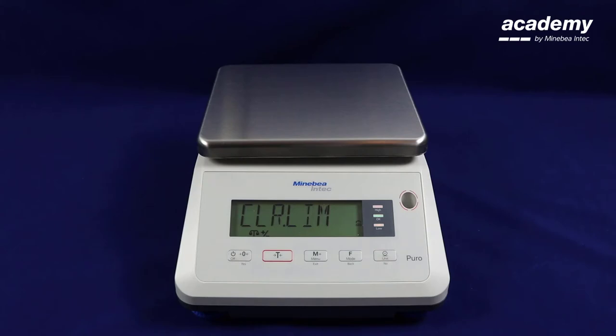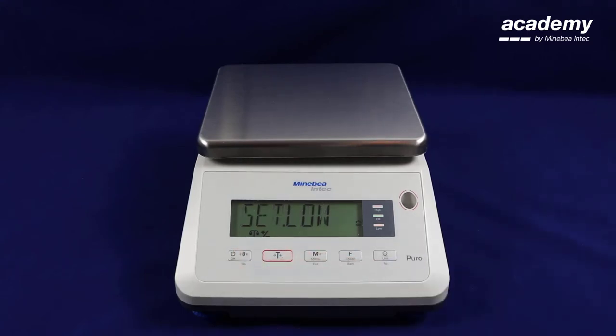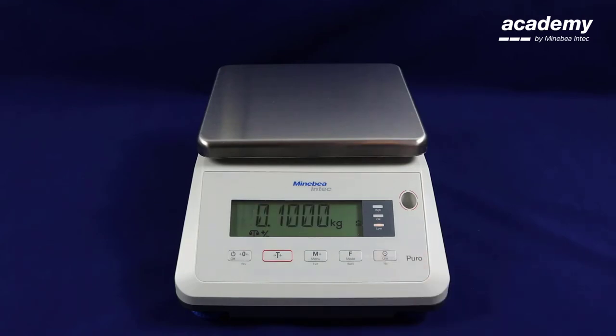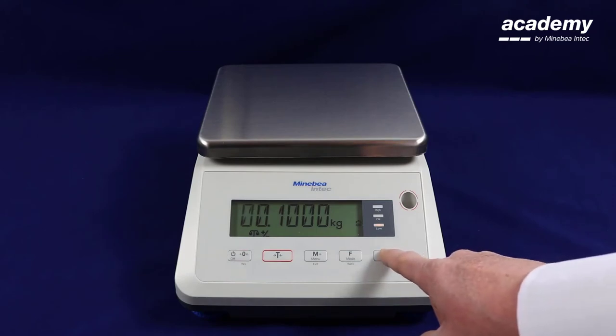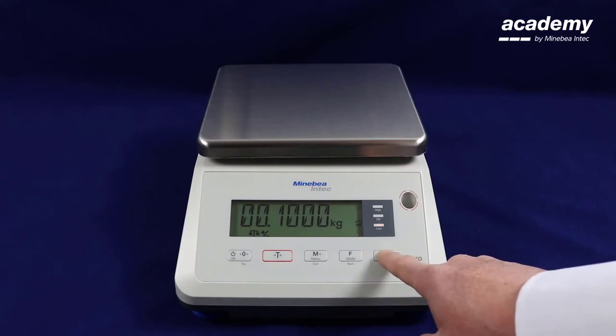First it will say clear limits. This is if you have previously been using the application and have any stored limits in there. Press yes to clear the limit and now it will prompt you to set the lower limit. The previous setting is displayed here. To change it press the no key. This will start the flashing of the first digit. We can either confirm the digit with the yes key or change the digit with the no and back keys.